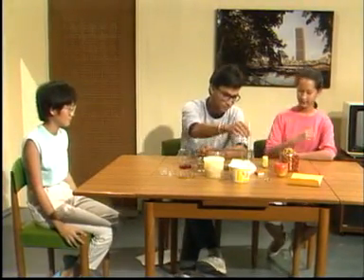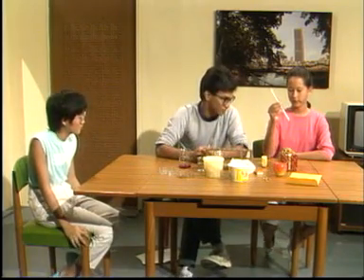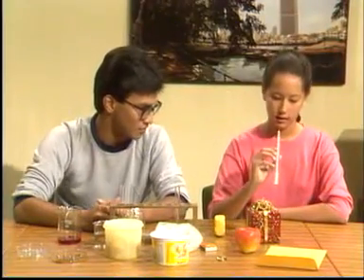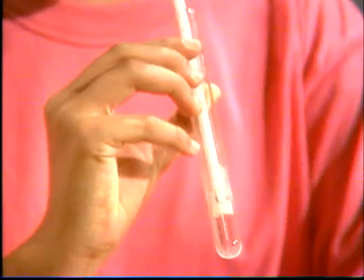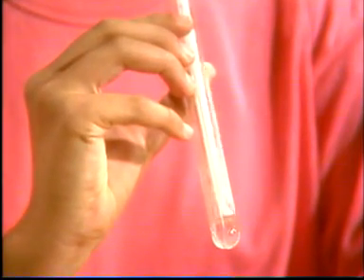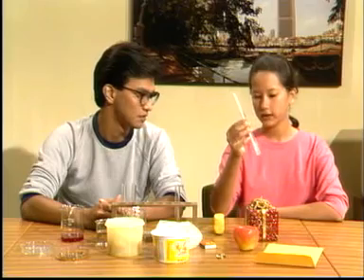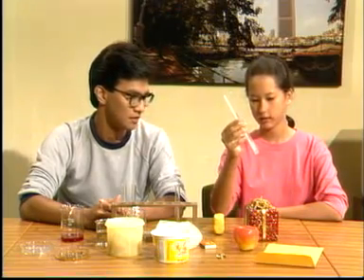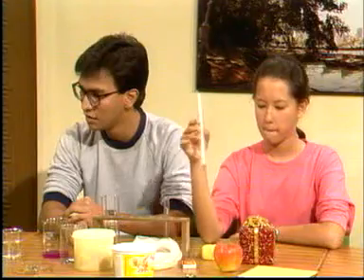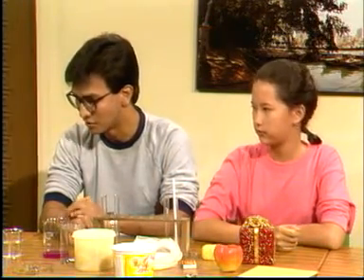Now, Sue, I want you to blow into this liquid of lime water. But before you do that, I want you to take note of the color of the liquid. It's colorless. Now breathe into the liquid. Do you notice what happened? The lime water turns chalky. Why? You breathe out a gas called carbon dioxide, and that turns the lime water chalky.